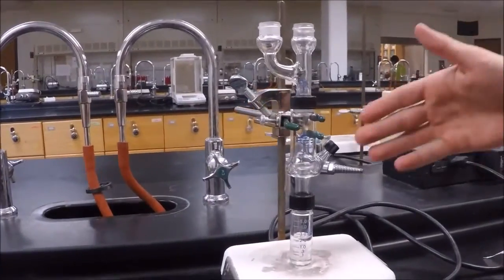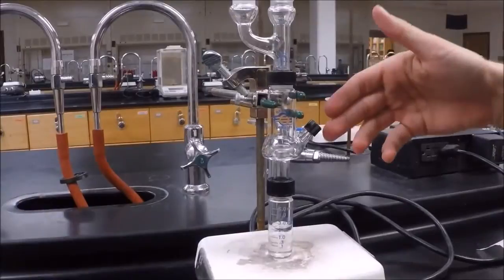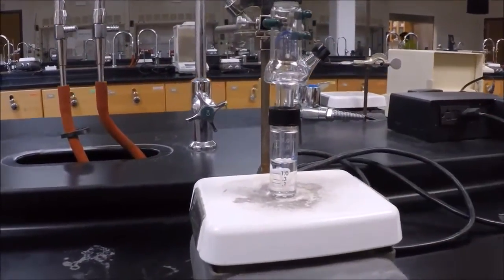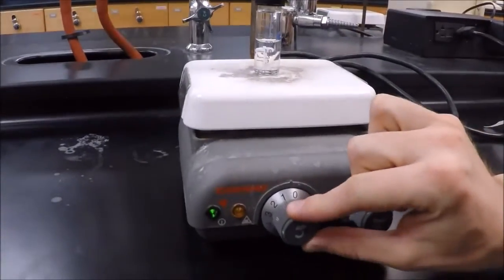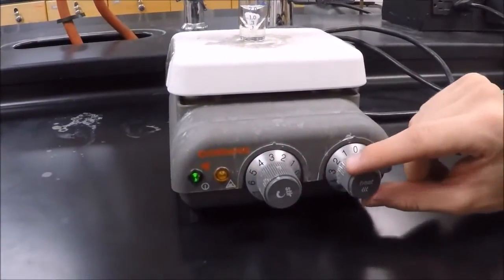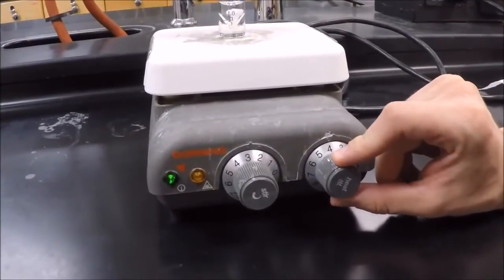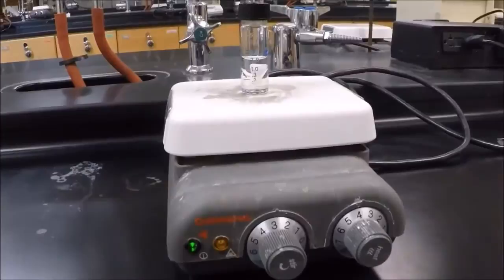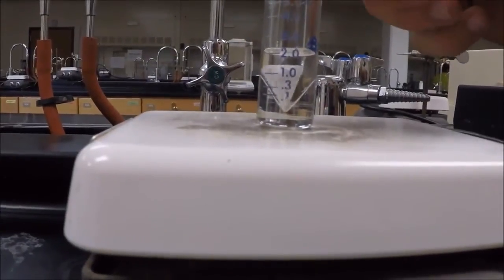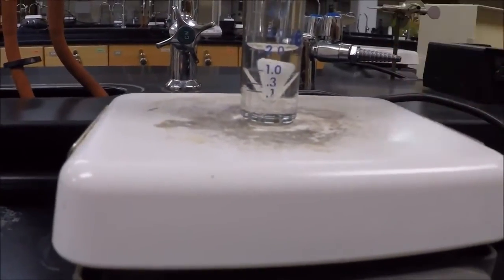Now we have our apparatus set up — the Clayson head, the Hickman still, and the conical vial with the spin vane inside. We're going to turn on our stir, just lightly stirring, not too much. Then we're going to turn on our heat — you can turn it on to about 4 and go from there. Make sure that your conical vial is touching the hot plate so that heat can transfer.